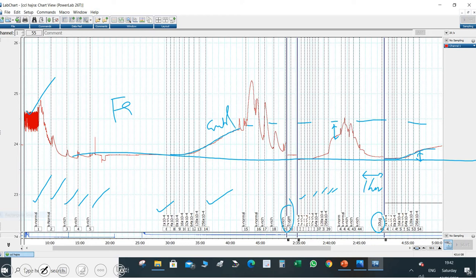So if I club this curve and this curve together, you will get a curve like this one. You see, this is control, with a bit lower amplitude with 5 microgram and much lower amplitude with 10 microgram. This is with 5 microgram, and this is the control curve.